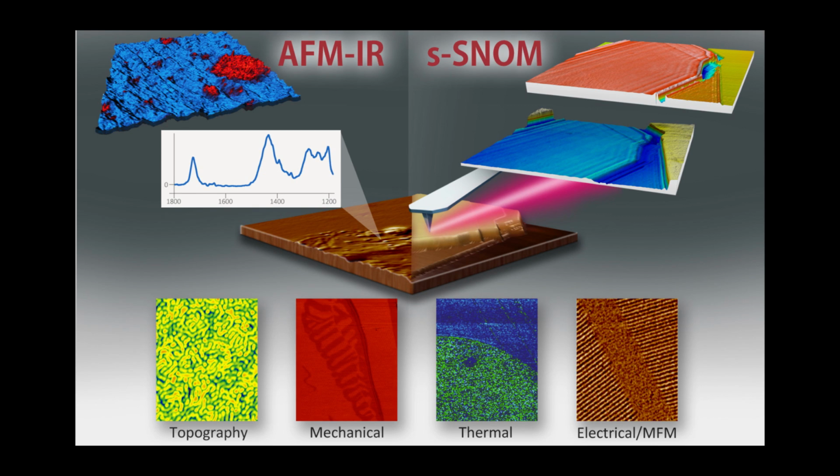Okay, we have another question about the laser source. I'm not sure I understand this question, so if I answered incorrectly, feel free to ask a follow-up question. But I think this is a question about the new source for resonance enhanced that covers the CH, NH, and OH, and the question is, is it also a QCL?